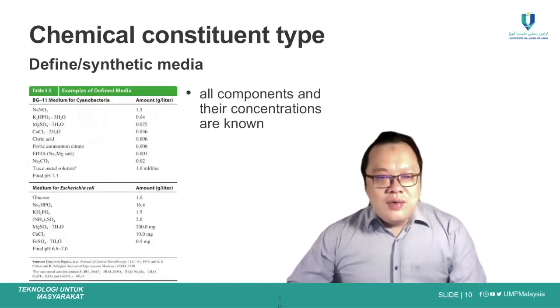Let's look at the types of media that can be grouped depending on the chemical constituent of the culture media.